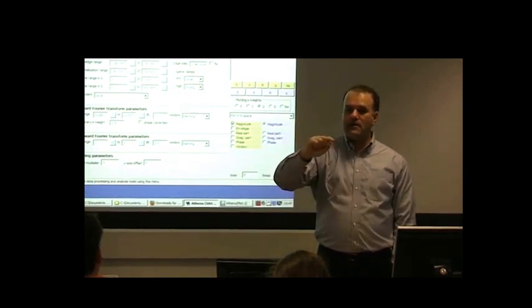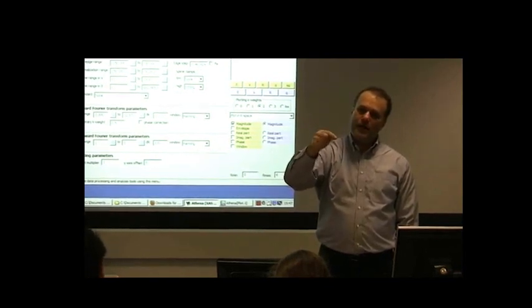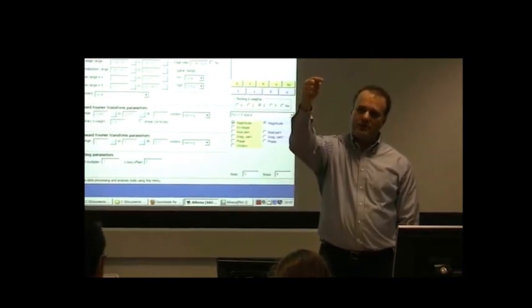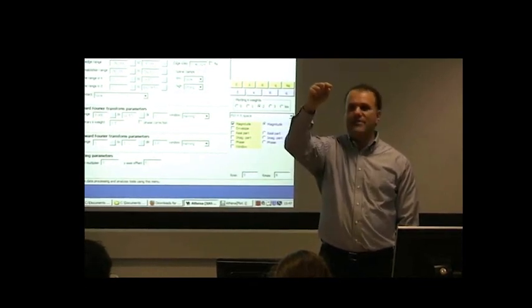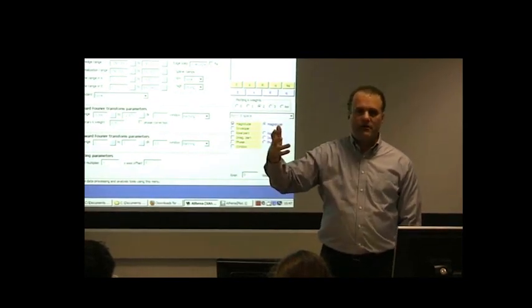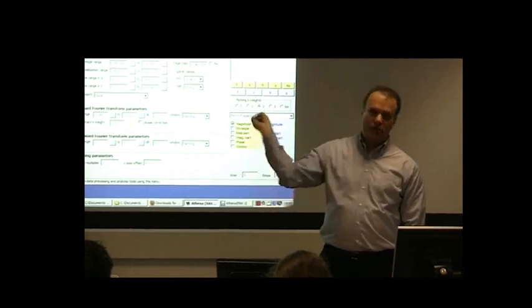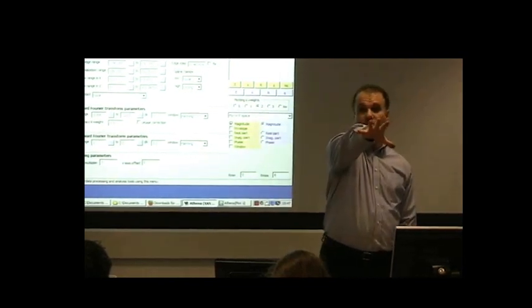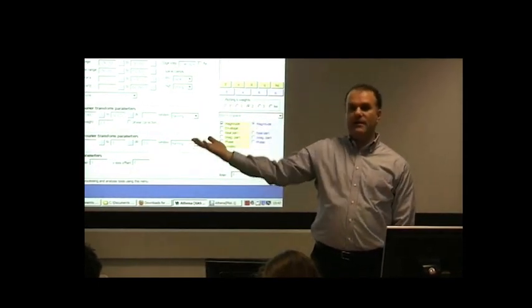And if the photon comes in and interacts with the atom, that deep core electron is going to be promoted into some continuum state. Right? So there is going to be an edge step. And that edge step is going to have some exponential decay because the more energy the incident photon has, the more likely it is that it'll just blow right by the atom and not interact with it. So there is an edge step, even in the isolated atom.